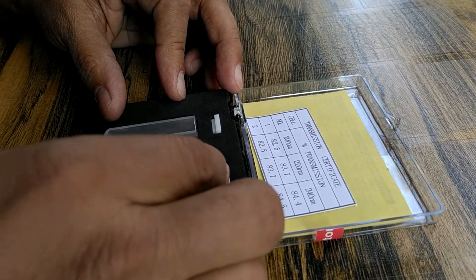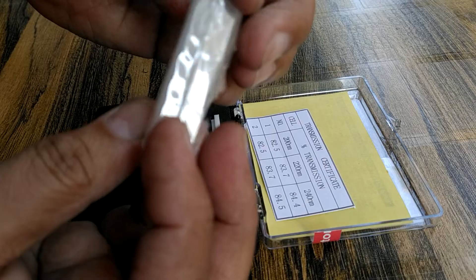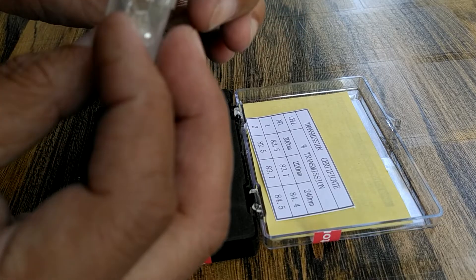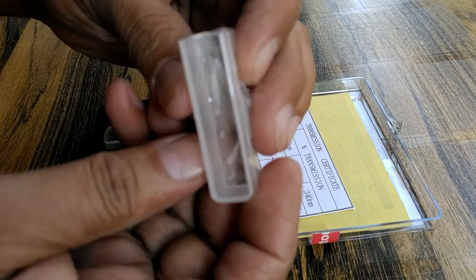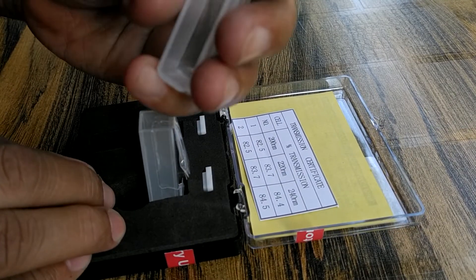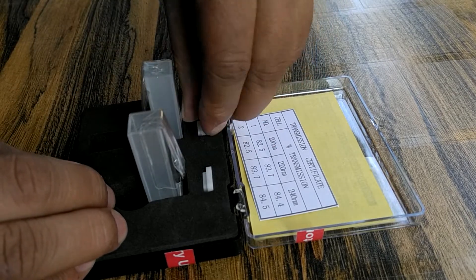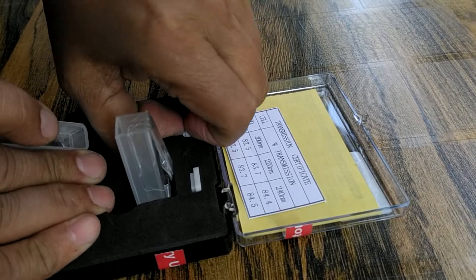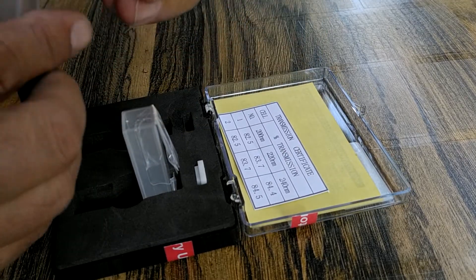Pair of 2, quads covered. Two sides visible, too opaque. Two stoppers, like this.